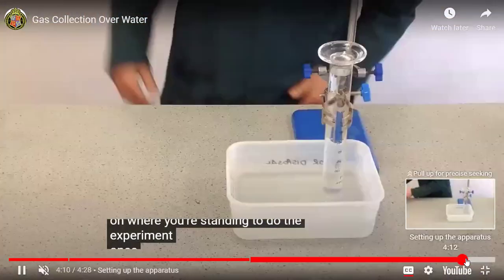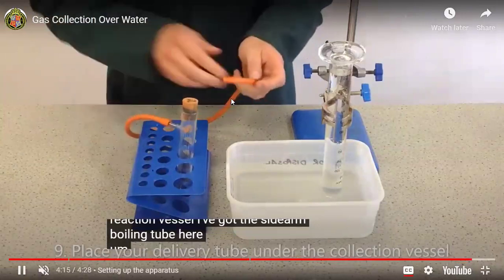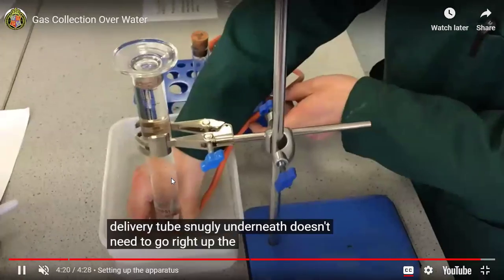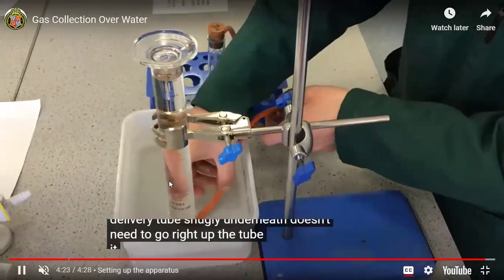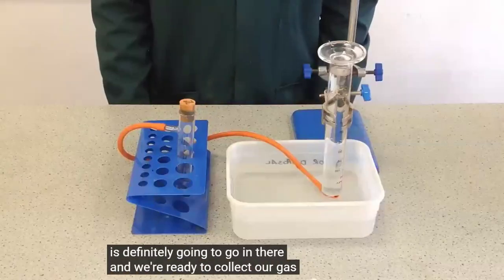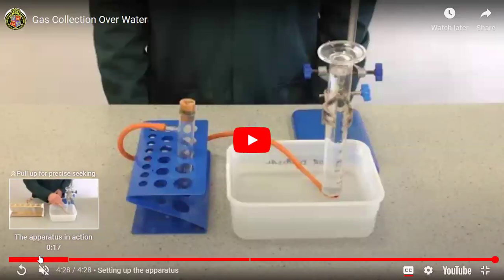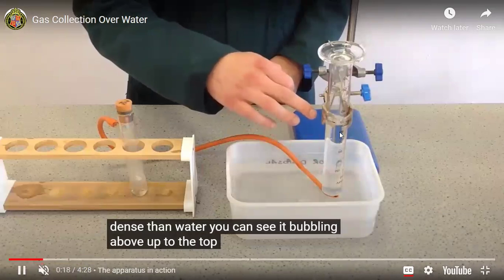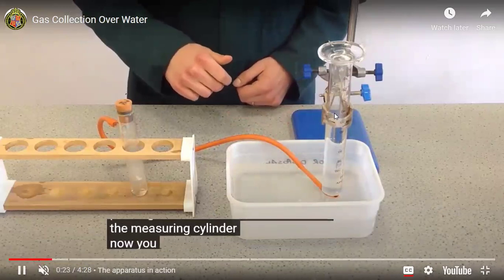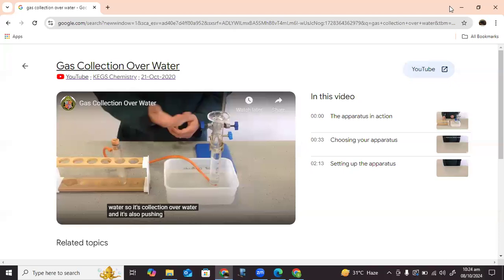There should be some space over there so that the gas which is produced, through a pipe, can just move to this measuring cylinder. And you see, he has done the setup completely, right? And you have seen it in the start when the gas was produced, how it was collected. You see? So in this way, water goes out into the container and the gas will be trapped in it. So this is the way how we collect the gas over water.